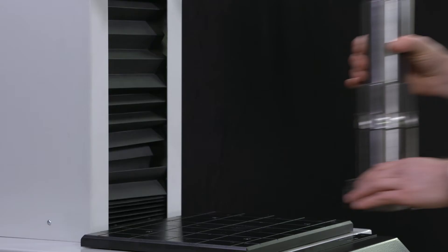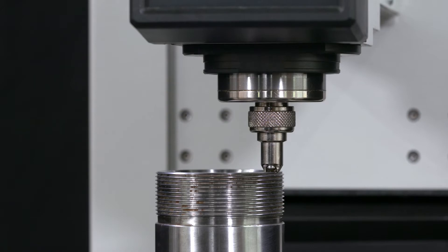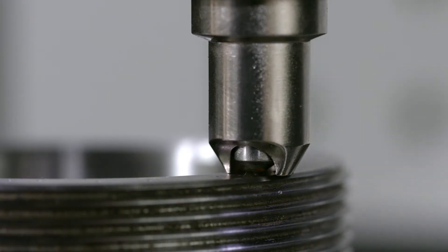Test force is electronically controlled with 1000 pulses per second and 0.05% load accuracy.